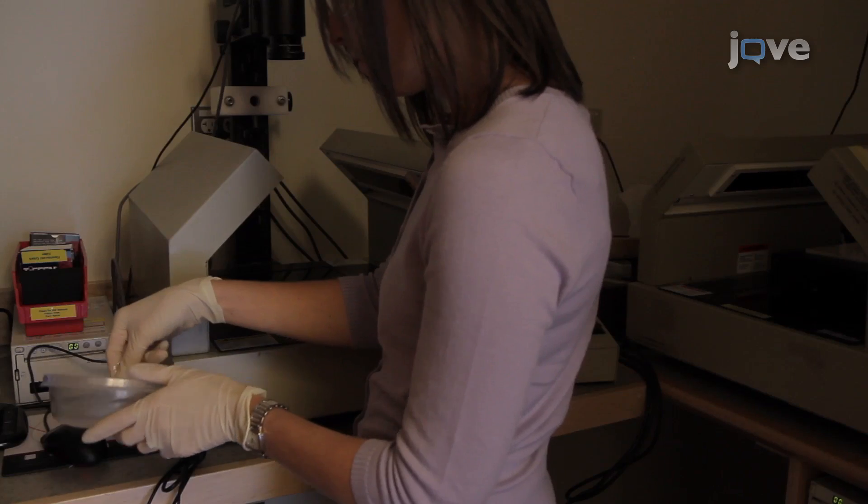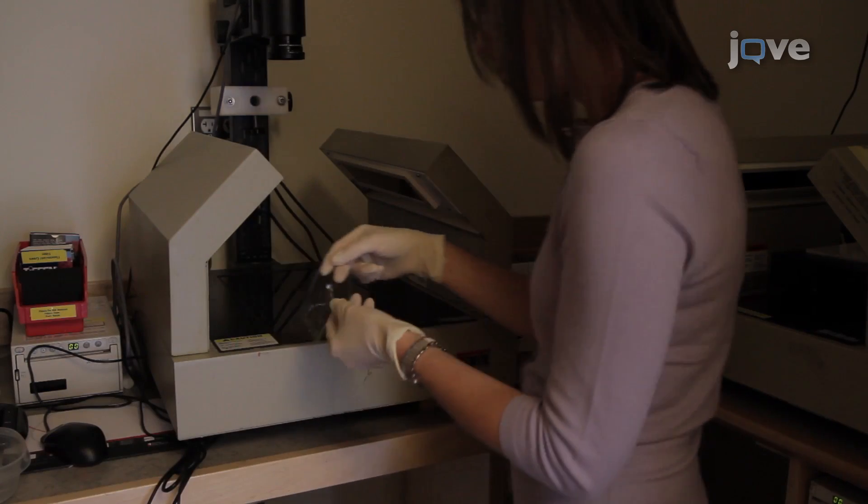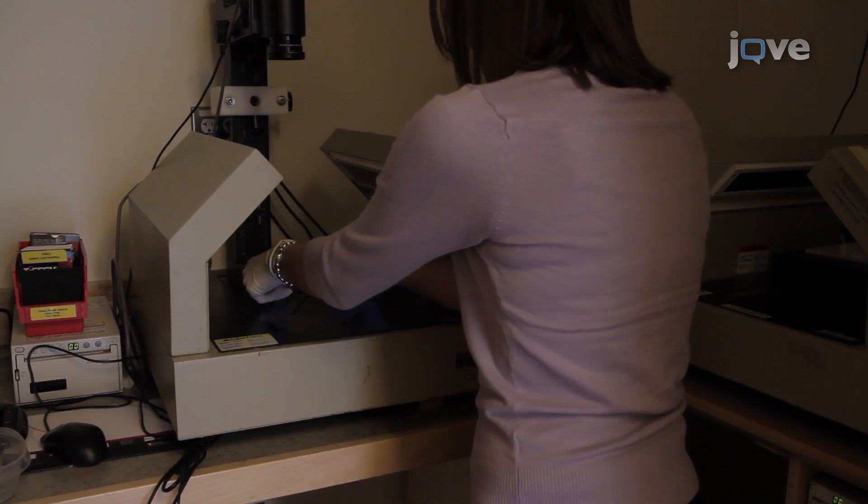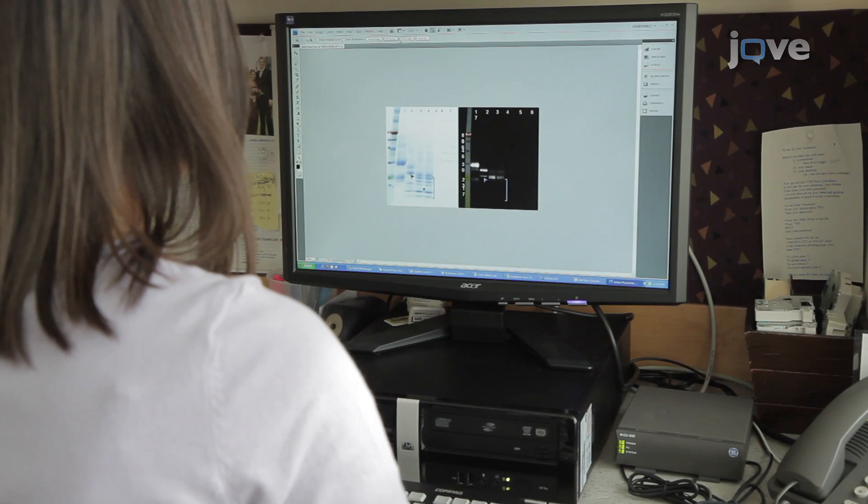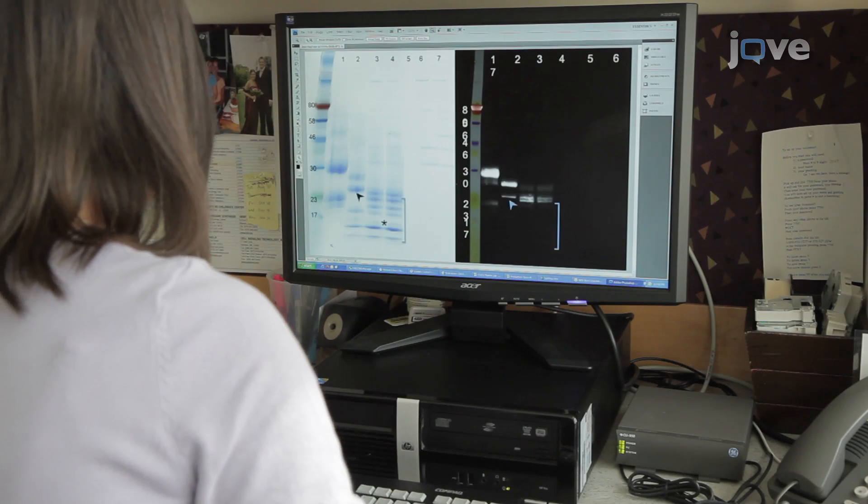Then, record the images with a UV transilluminator at 300 nanometers. As a final step, compare the images of the Coomassie stained gel with the Pro-Q emerald stain gel.